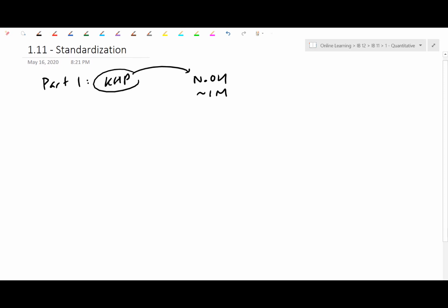Remember, KHP here was a solid. I had told you I'm going to dissolve in 18.38 grams here. I just want to show you roughly how I get that number. KHP, I'm not going to give you the whole formula here, but it does have a molar mass of 204.22. Remember, between the burette concentration, the NaOH here, and the KHP, I want them to be fairly close so that I'm not wasting tons and tons of solution.